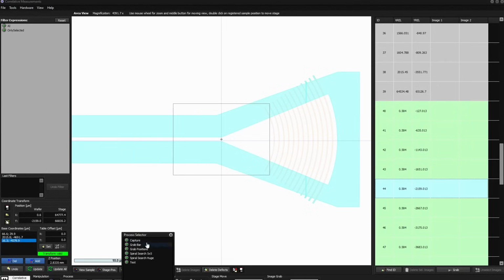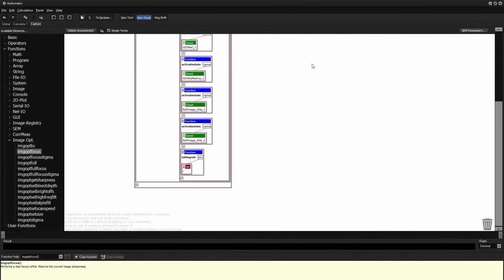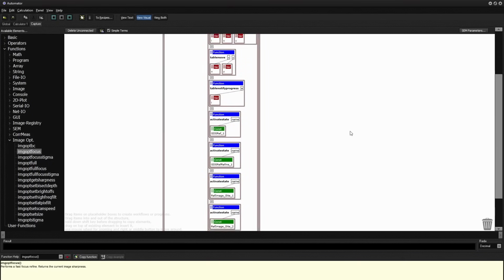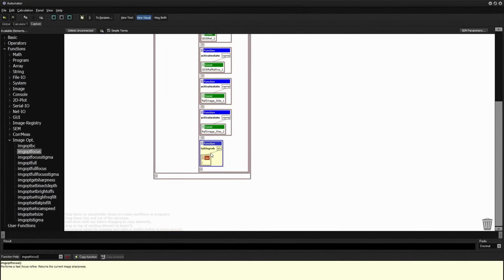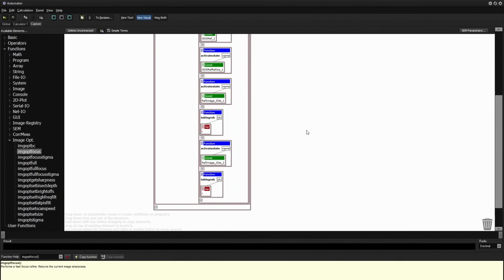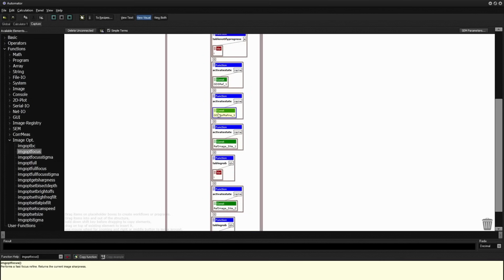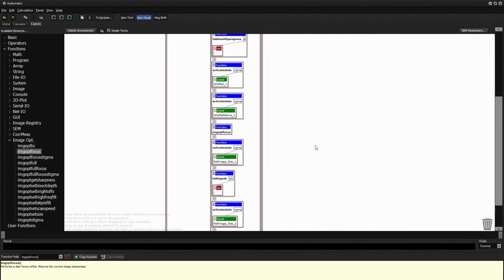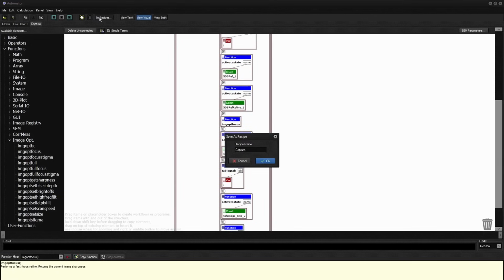One thing we have to change now, we have this capture recipe here. We go in there and you can see we have the 4 states we have just created in a script and after the movement. But there's only one grab function at the end. We want also to grab an image here after we have switched to site 1. So we copy this here. And after the refining step, we can also put in an autofocusing step. Okay, that's the whole recipe. We copy it back to the list of recipes.